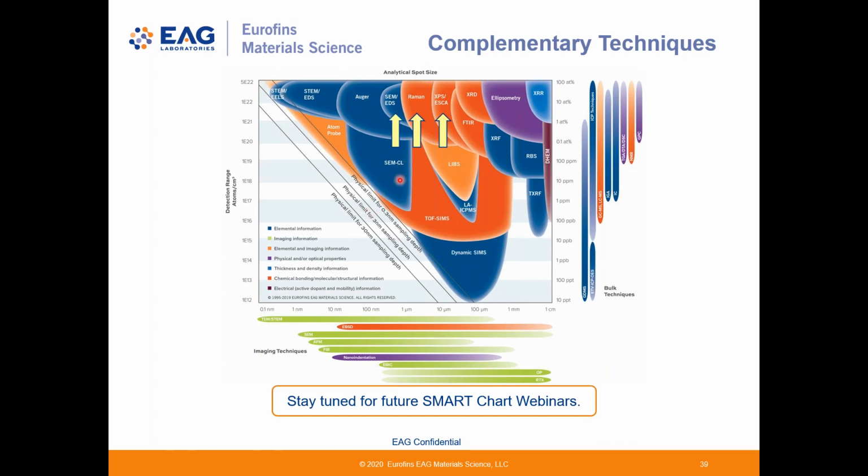SEM EDS, I mentioned before, has excellent imaging resolution, offers very good elemental analysis for areas and down to depths of about a micron or so. For the ultimate in spatial resolution, you go to STEM with EDS and EELS, electron energy loss spectroscopy, to identify elements.